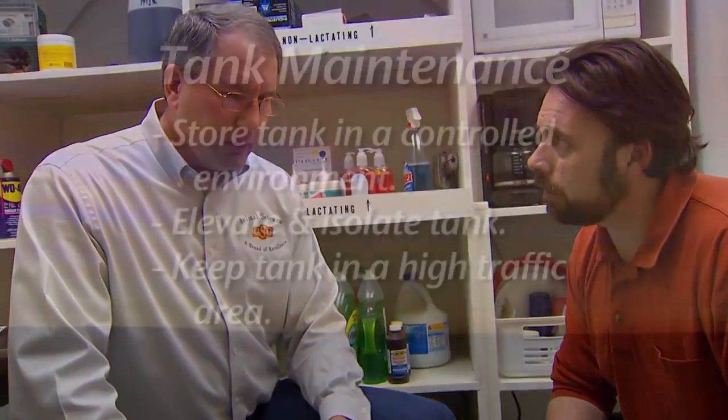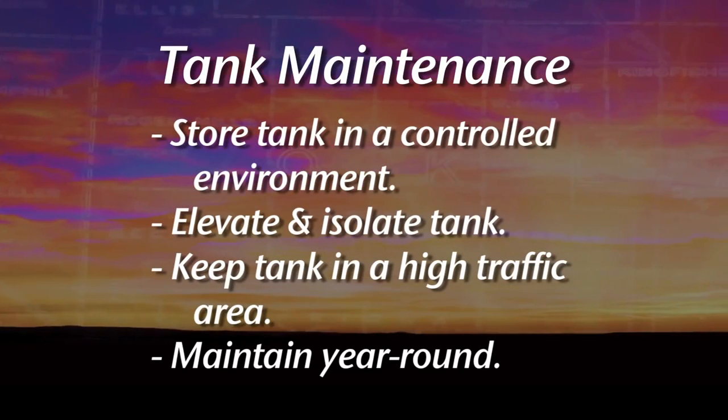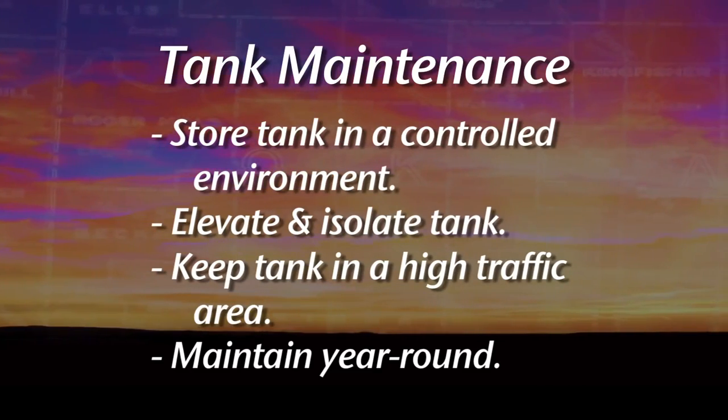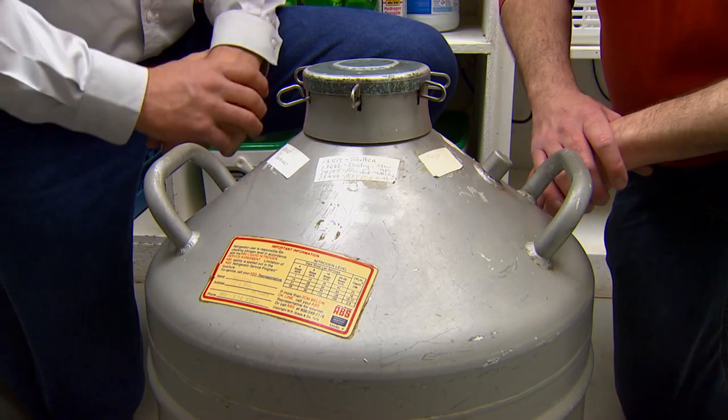Now, obviously we're not using this thing necessarily all year. Is it something you put up in storage? Do you want to keep it in use all year? I'd recommend keeping it full all year. Most of the time you're not going to use the semen that you purchased for that breeding season in just one go. And so I suggest just keeping it maintained.